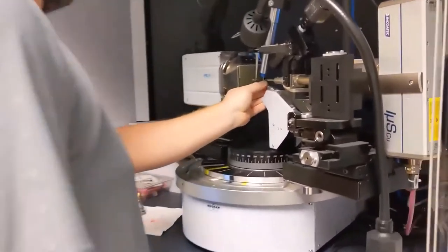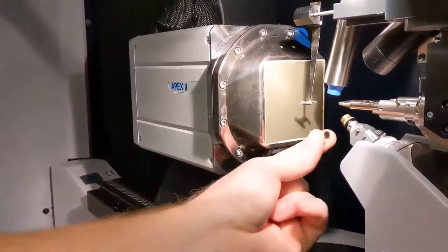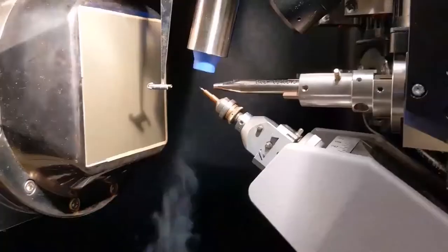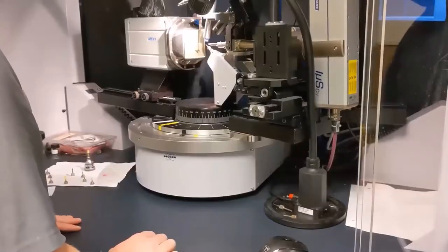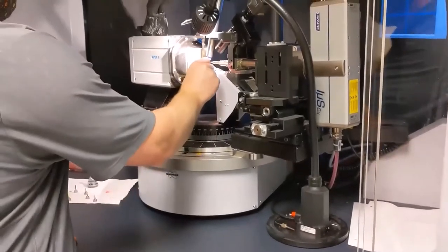The 100K nitrogen stream will solidify the oil, which acts as glue to hold the crystal on the mount and as a protective coating for air and moisture sensitive samples. The copper colored disc you see on the goniometer head is a fairly strong magnet that holds the mount securely in place. Now that the sample is mounted, it needs to be centered.